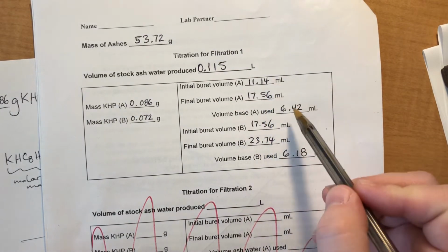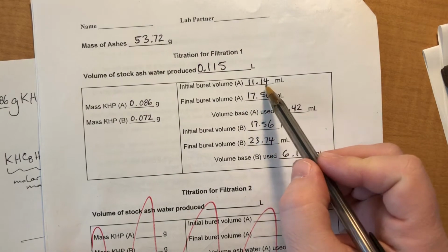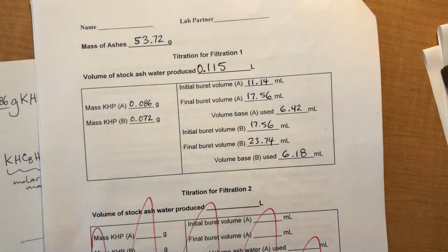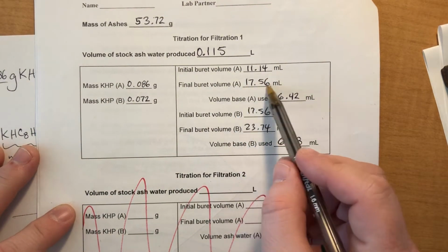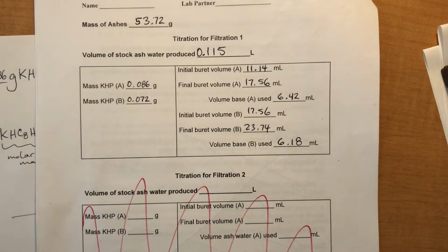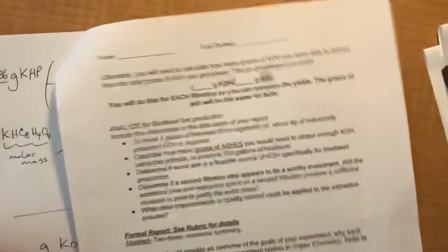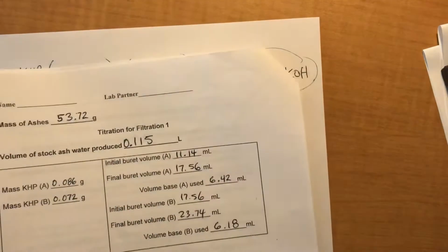The difference between those numbers is the volume of the base used. So if you take 17.56 minus 11.14, which were my made up numbers, I got this number. Your number might be like 2 point something or 6 point something or 17 point something. I have no idea what your numbers are. My final value for the first run is my initial value for the second one. I did a second titration and I got a value of 6.18. Great.